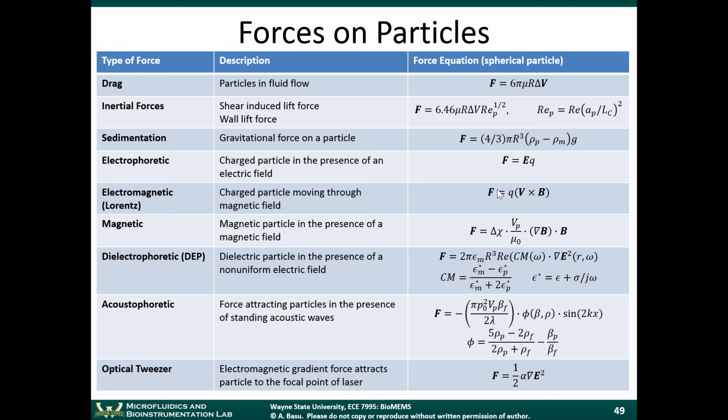There are electrophoretic forces. Particles respond to an electric field. Electromagnetic force, the Lorentz force, we talked about when we were talking about magnetohydrodynamic pumps in the previous module. Magnetic forces, if the particle is magnetic, are used throughout biology nowadays. They often use magnetic particles, and you can sort out the particles just by putting an external magnet on there.